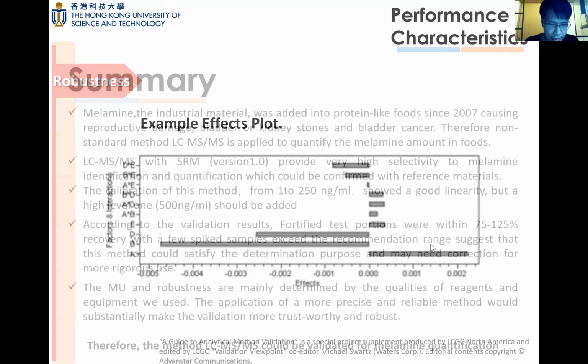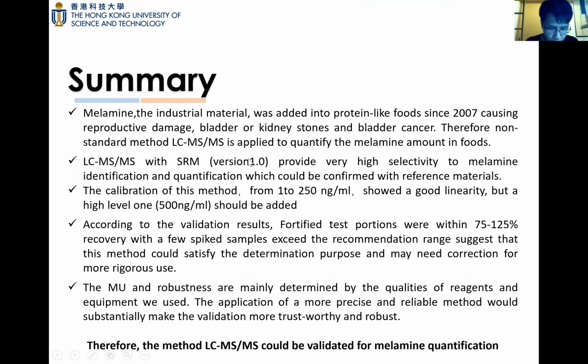So since the method is highly selective, shows good linearity with good recovery and so on, we could draw a conclusion that LC-MS could be validated for melamine quantification.